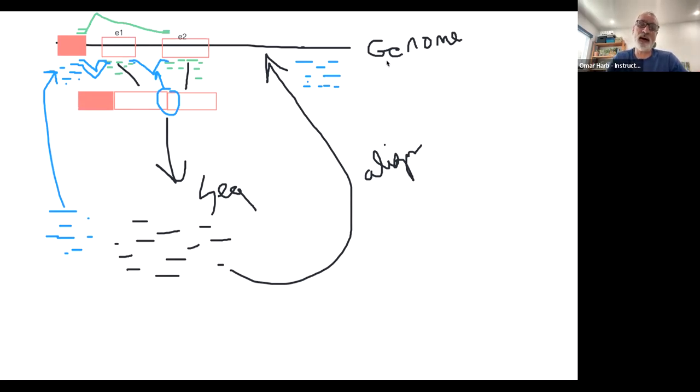And so now when you're looking at this, you will say, wow, this gene is not only expressed potentially as a 2 exon gene, it may have a third exon that's upstream, which sometimes all 3 of them are spliced together, but there are some cases, maybe it's a developmental cycle, or maybe it's just an alternative splice variant, where the exon 0, let's call it, is spliced to exon number 2. And so now you can generate a new gene model that's an alternative gene model for this particular gene.